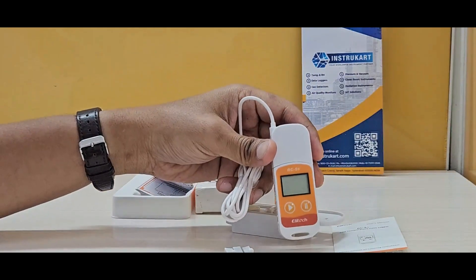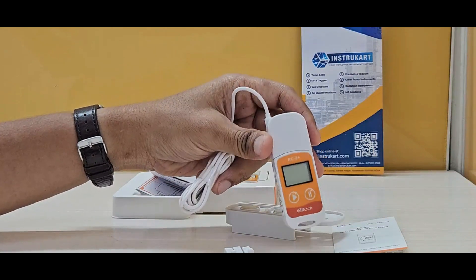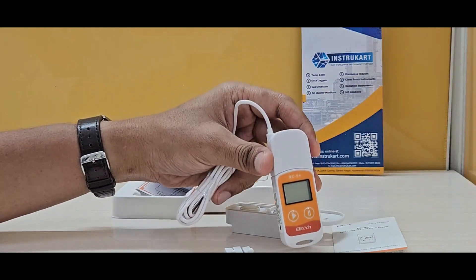It also features automatic PDF report generation and holds FDA EN 12830 certification along with CE and ROHS certification.